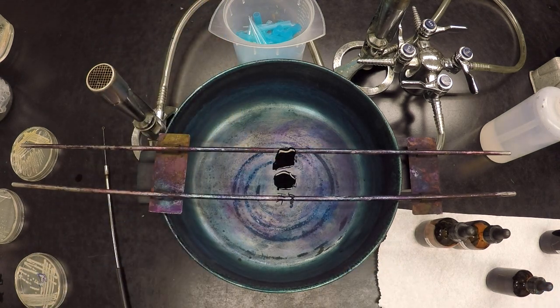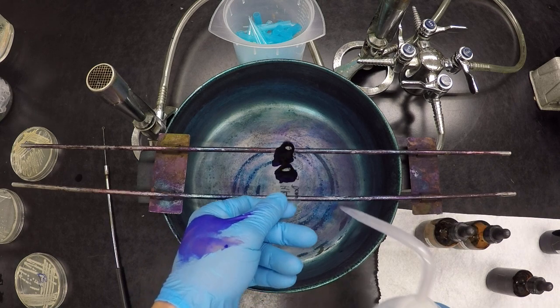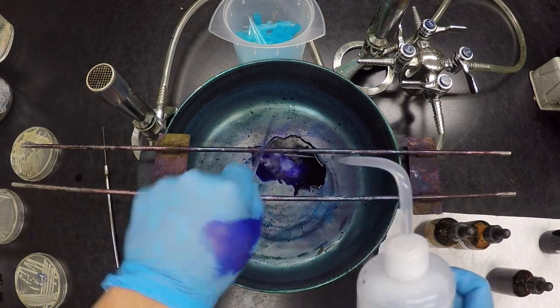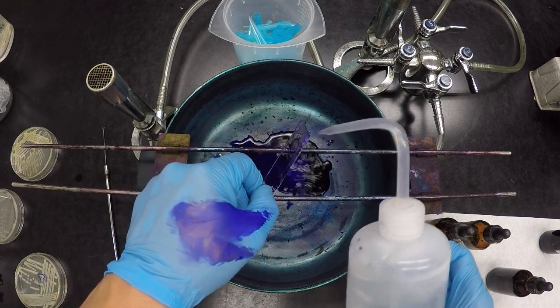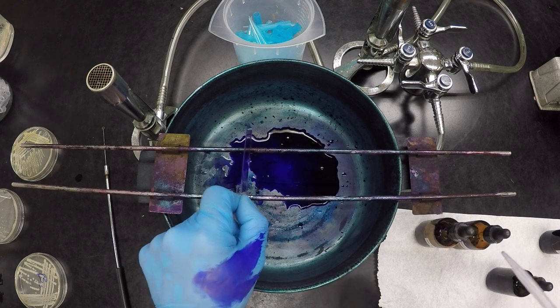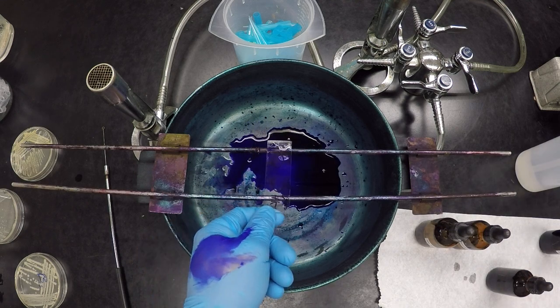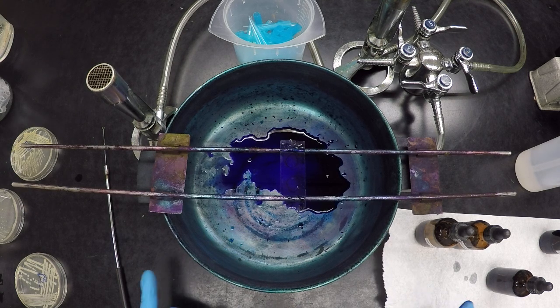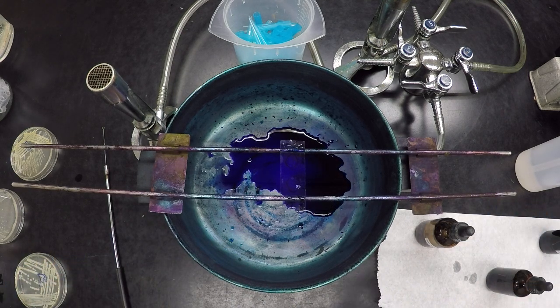That's been long enough. Now we rinse, and at the end of every stage we're always going to want to rinse. So remember, tilt, hit above the smears, let the water roll down, don't necessarily spray it right on the smears, tap it on the edge like that, and we are good for our next step. Now we don't need to blot dry because everything goes on wet.